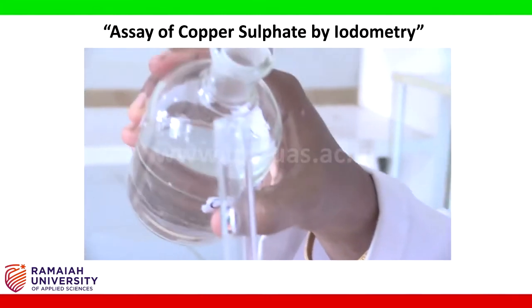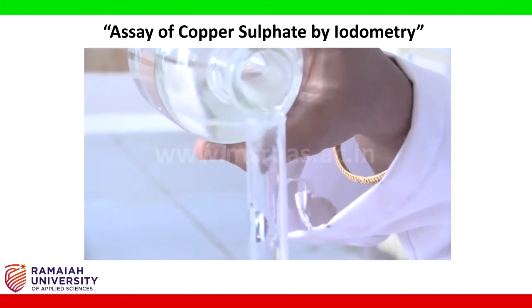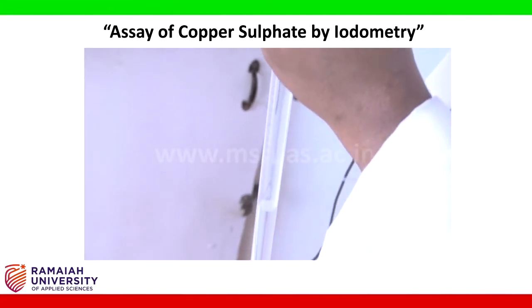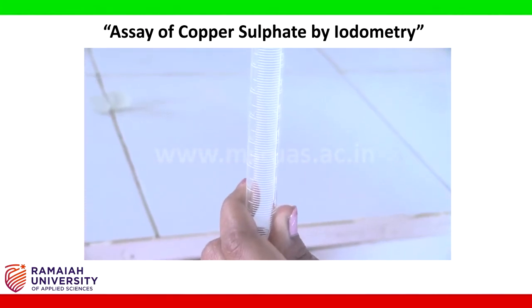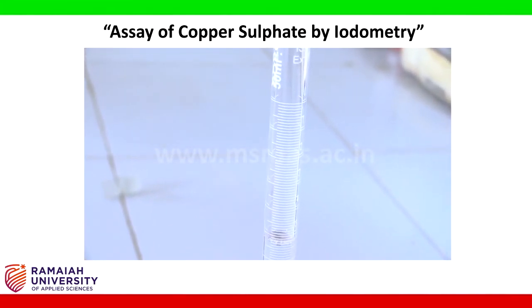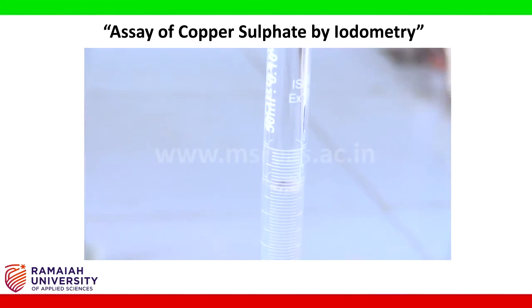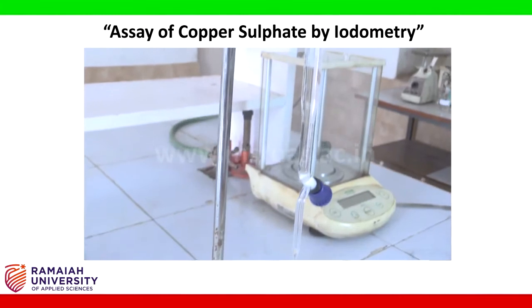After filling the burette, keep it in the stand.